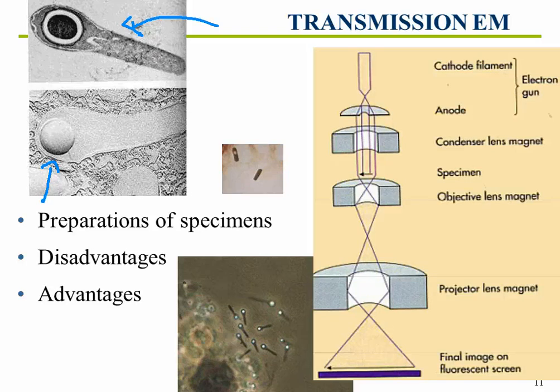Compare these EMs with a gram stain showing an endospore in the left-hand cell and a phase contrast view where the spores are refractal and light. They look like tennis rackets. Well, they look like the racket part of the tennis racket.